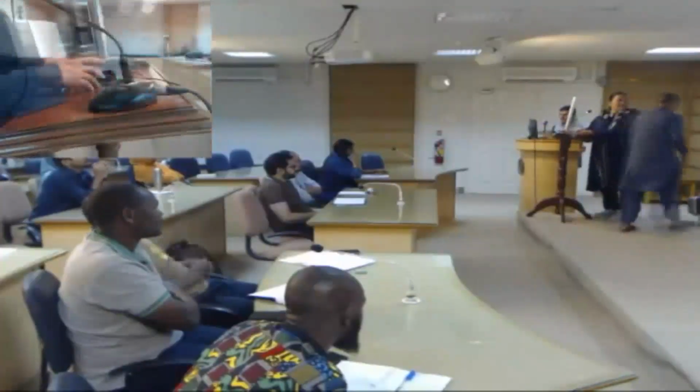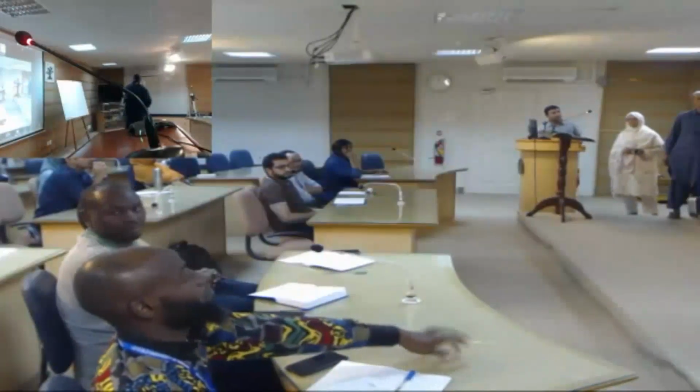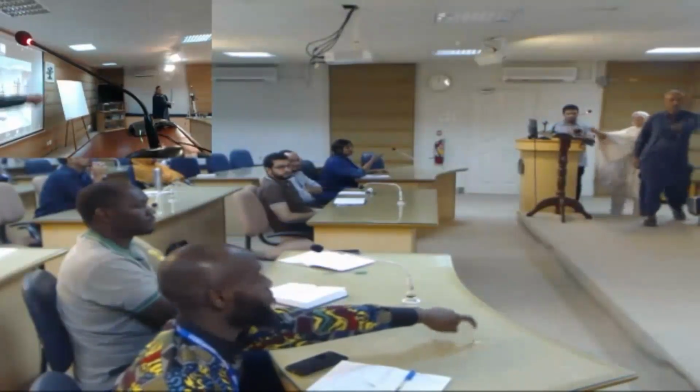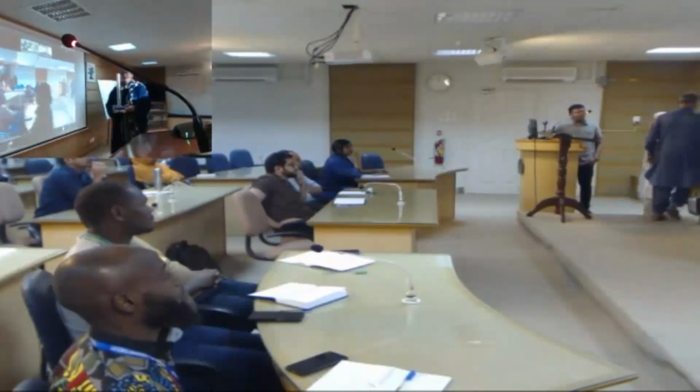Can you see this in the video? I can see that. Yes, please. I can bring it closer to the camera. It's all right, Atya, you can explain it, please. You know this thing better than me.